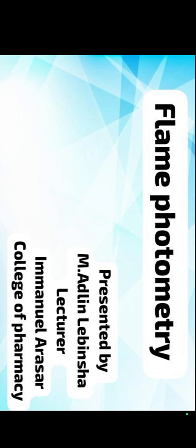Today's topic is flame photometry. First, we see the introduction. Flame photometry is also known as flame emission spectroscopy. These are the other names of flame photometry. It is one of the emission spectroscopies, used to detect metals belonging to group 1A and group 2A of the periodic table. For example, sodium, potassium, lithium, and magnesium are detected.